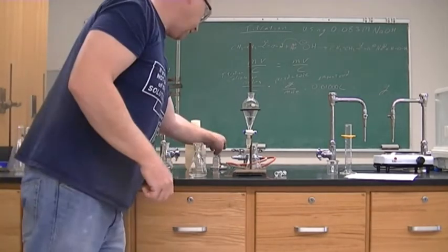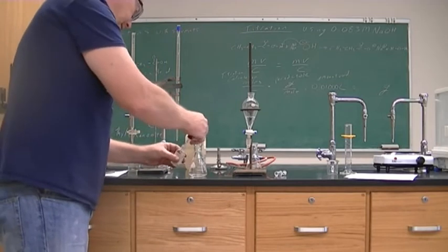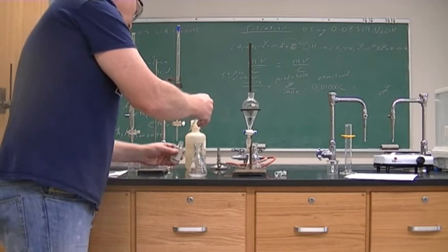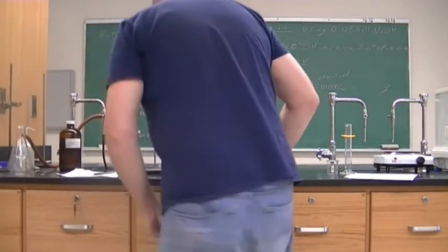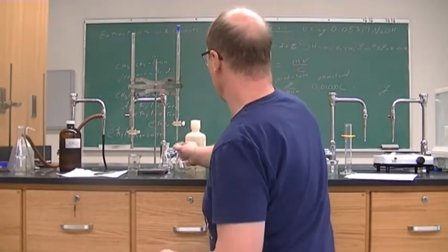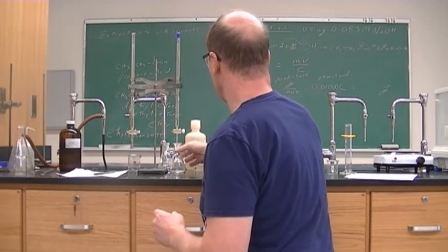Again, we're not going to get a color change unless we add our phenolphthalein. So let's add 4 or 5 drops of phenolphthalein. Now we're ready to do our titration. Again, we're going to titrate it until it stays pink for at least 30 seconds.